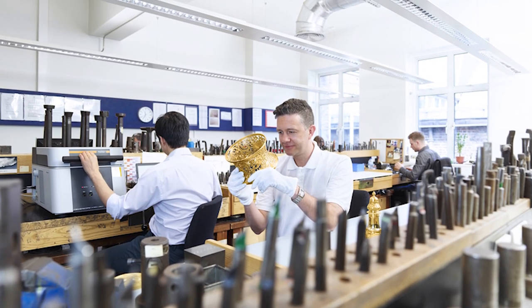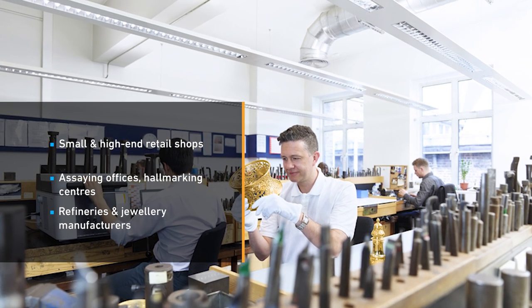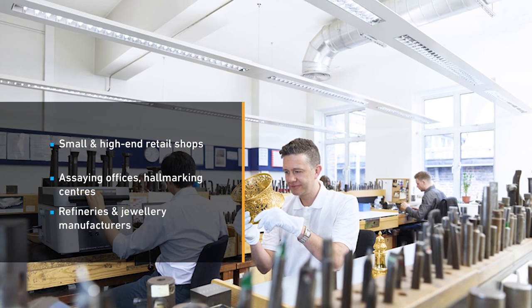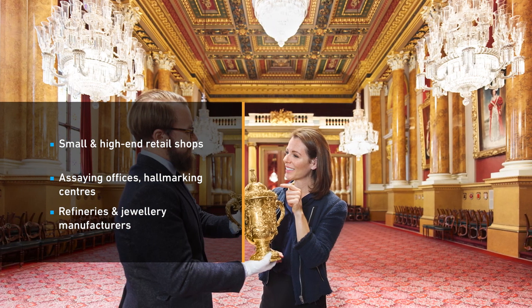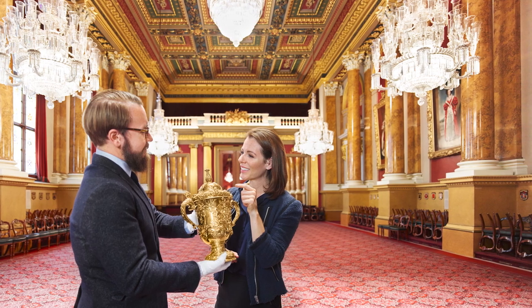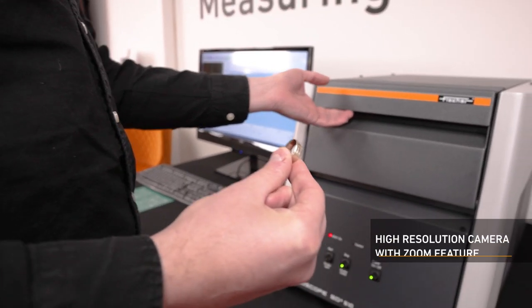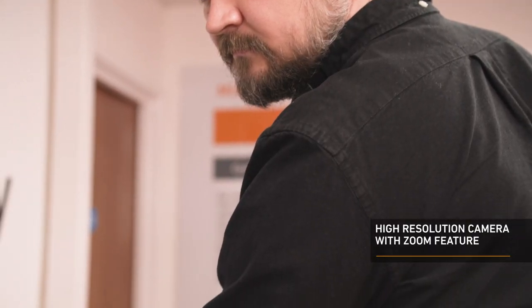The different instruments in the Fischer GoldScope range can address a variety of measuring requirements, including small retail shops, high-end retail showrooms, small and large assay offices, hallmarking centres, refineries and jewellery manufacturers. The instrument has a high-resolution video camera with zoom to enable easy sample positioning and precise measurement spot adjustment.